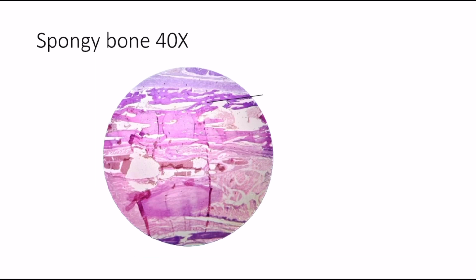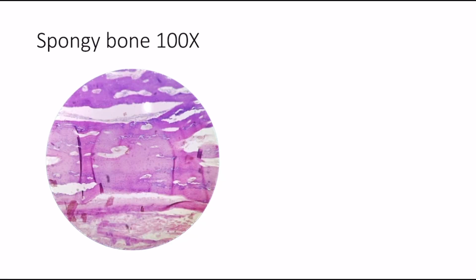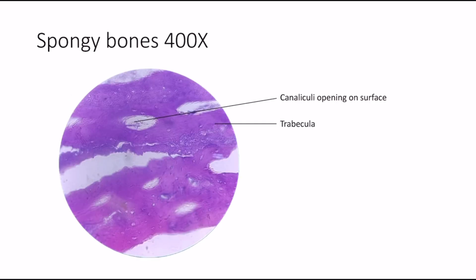This is a slide of spongy bone or trabecular bone at 40 times, an open network of struts and plates. At 100 times, the trabeculae and canaliculi opening can be seen. At 400 times, the bone cell osteocyte can be seen.